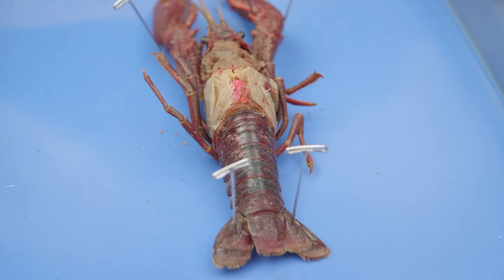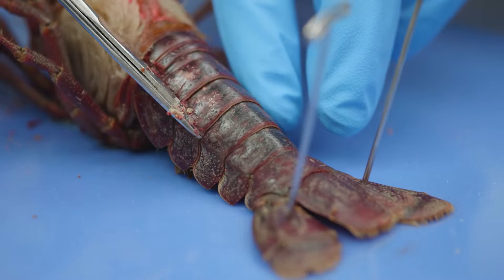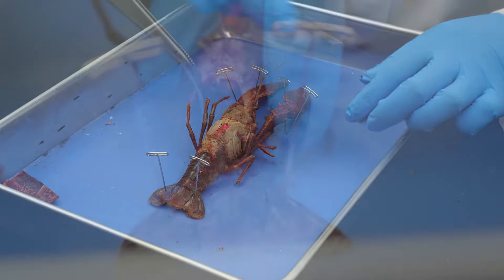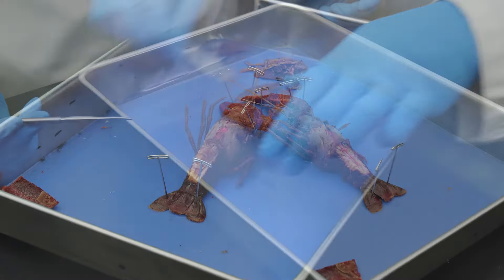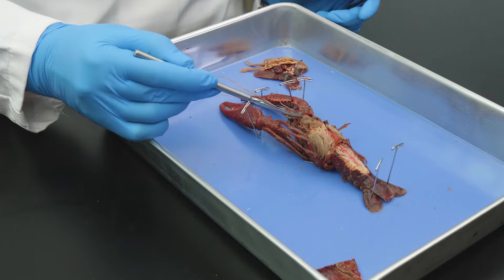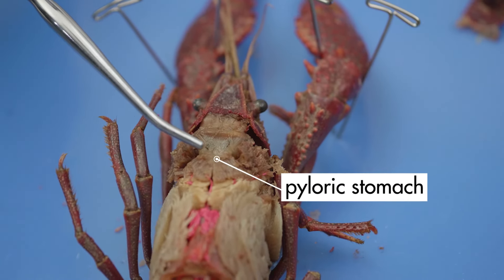Next, we need to remove the exoskeleton covering the dorsal side of the abdomen. We make an incision along the top of the abdomen to the tail fan and carefully lift off each segment of the exoskeleton covering the abdomen. Now we can see some of the organs of the digestive system. The crayfish has two stomachs: the cardiac stomach and the pyloric stomach.